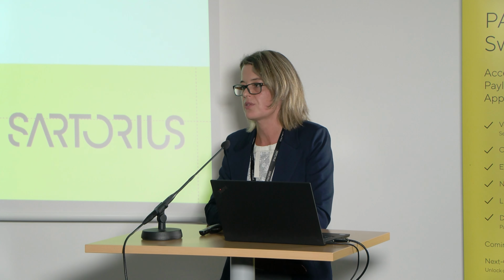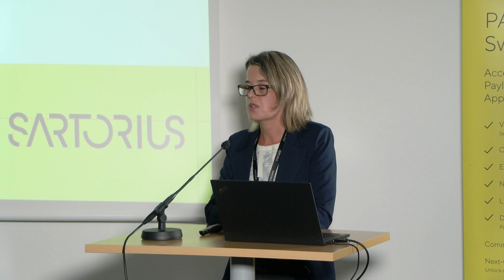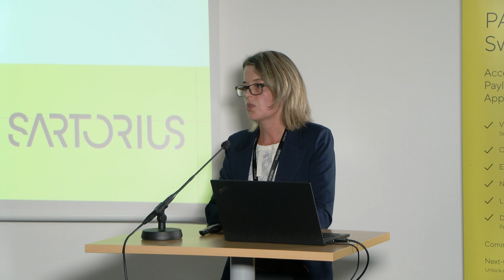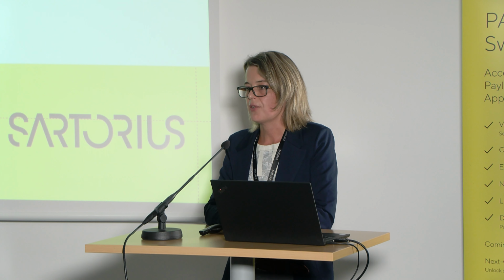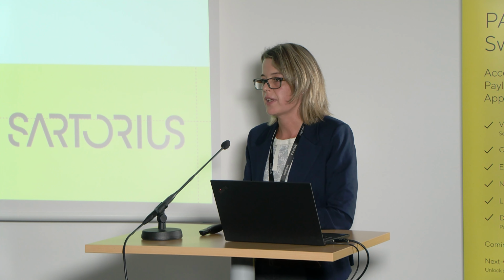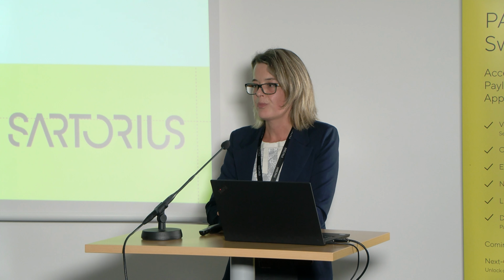We also did some stability studies in the meantime, and we showed that samples in those buffers are stable at different temperatures for quite some time, comparable to TFF. But of course, the final call is always on the producer.